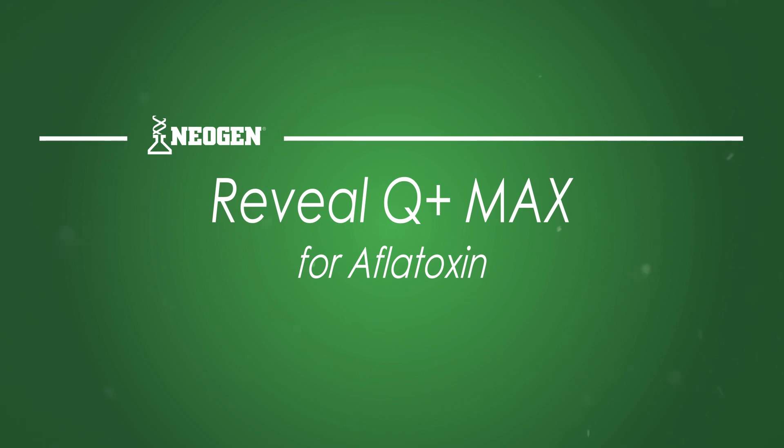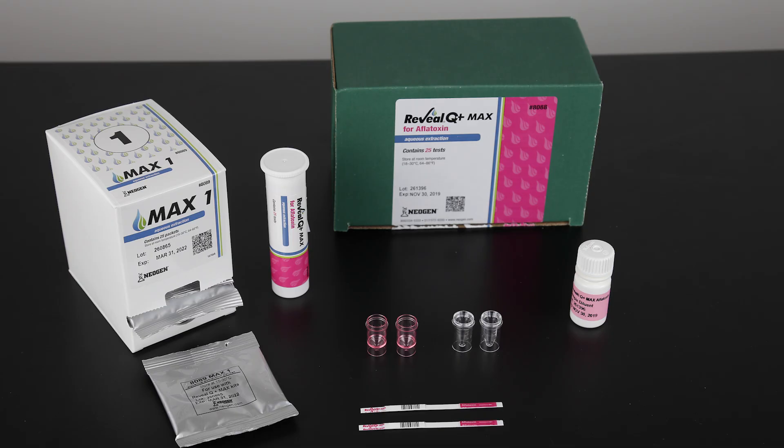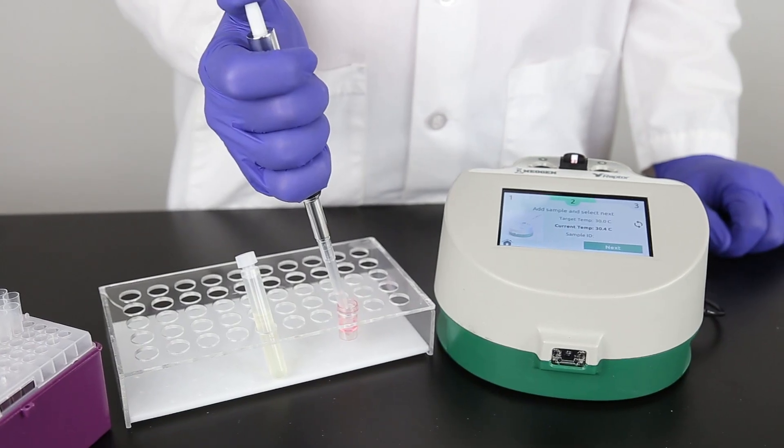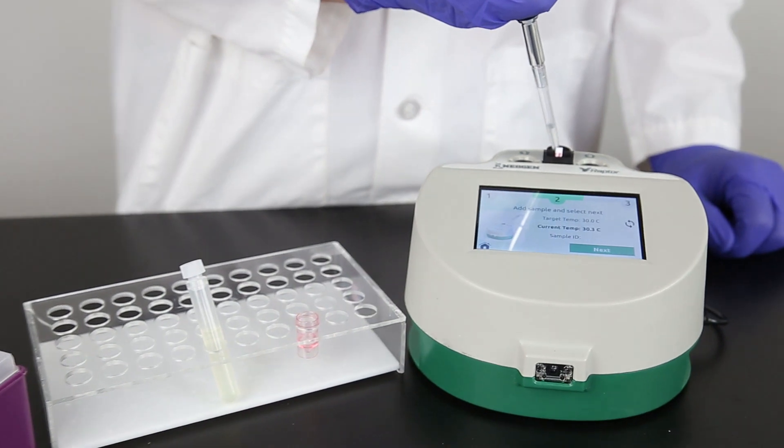In this video, we'll look at everything you need to know to run Reveal Q Plus Max for Aflatoxin using the Raptor system. The Raptor system allows you to add sample and walk away. It's that simple.